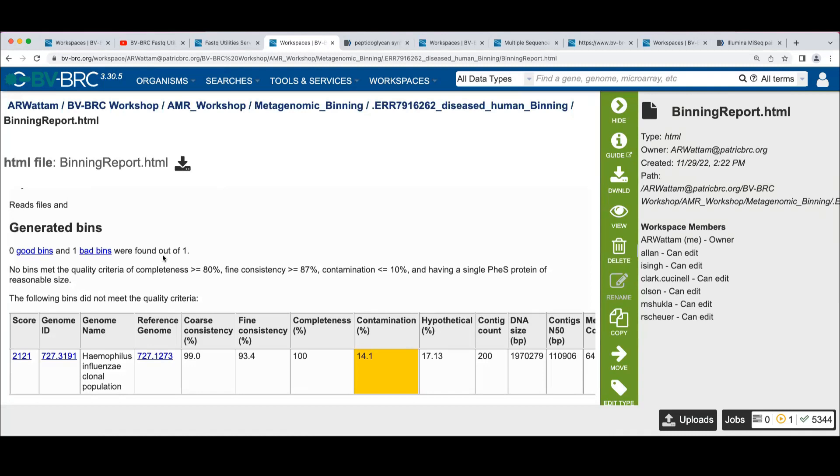Part of the process of doing the binning is an estimate of genome quality for each of the bins that's created. And there's three main features that go into this quality check. There's one is a completeness percentage, which is, if you're familiar with CheckM, we don't use CheckM itself.